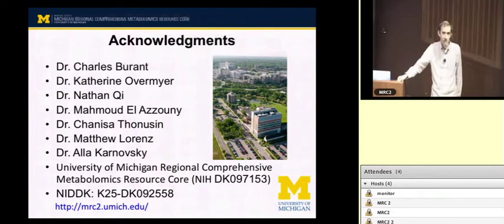So if they are an issue, if you're trying to study, for example, succinyl-CoA, then I would recommend strongly against a drying procedure in your metabolomics unless you have some way of chemically stabilizing, because that's a metabolite that will chemically degrade. For most metabolites, after you've denatured your proteins, the metabolome is stable. So it is a balancing act. You do have to consider it, but the key thing is the deactivation of your enzymes, and that allows things like drying steps to be at least workable for most of the metabolome.